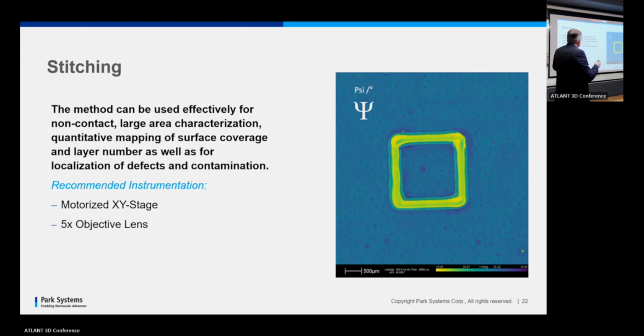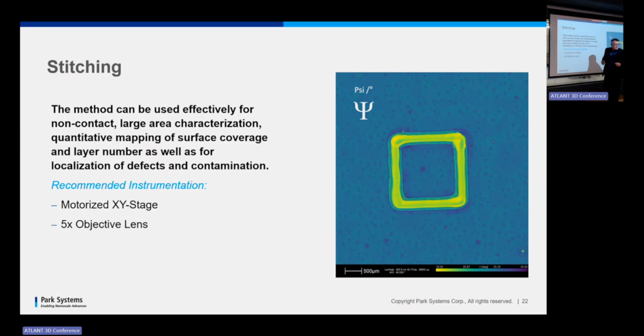And yes, the next point, and you saw some of these images. I think maybe you realized it, that you saw it yesterday in the first talk. We saw a number of these stitched images, and even yesterday, Ivan showed me a number of very nice stitches. So I think stitching is here the workhorse of the imaging ellipsometer.